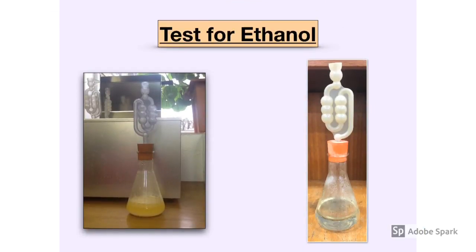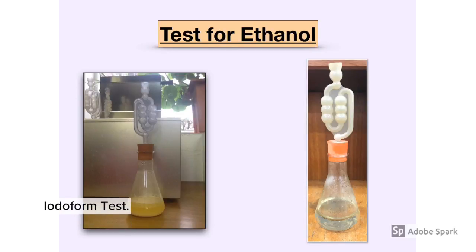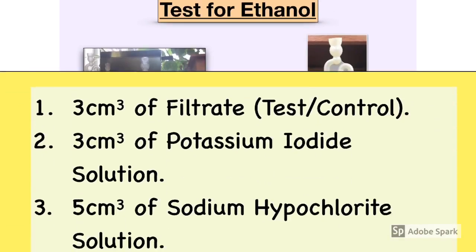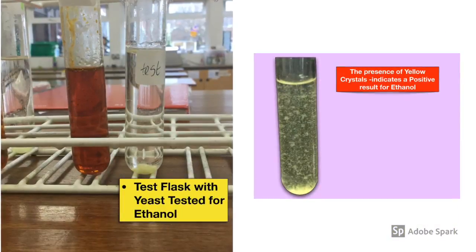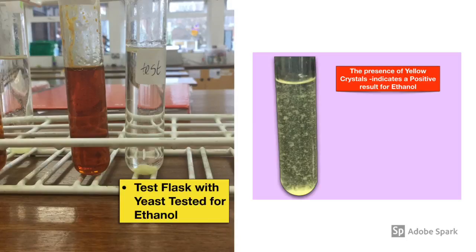The next part of the practical was testing for ethanol — proving that the yeast had anaerobically respired and produced ethanol. The test for ethanol is the iodoform test, and this was conducted on both samples. Yeast was removed from the test flask using filtration. Into a test tube, three cc's of the filtrate was placed into one test tube and three cc's of the control into another. To both samples, potassium iodide solution was added, then sodium hypochlorite solution, and both were heated in a water bath for five minutes. Yellow crystals appeared in the test flask — the flask which contained the yeast — and these yellow crystals are a positive result for ethanol.